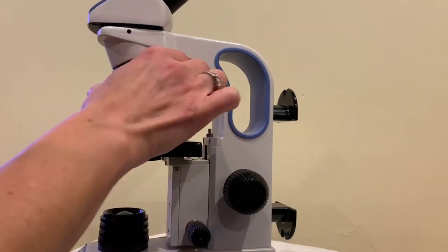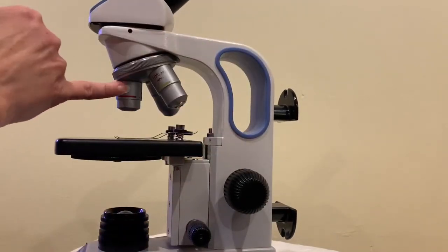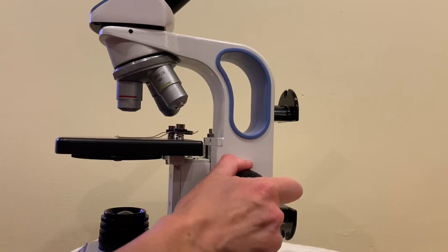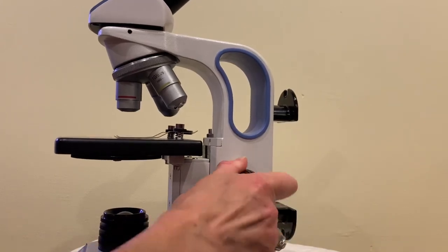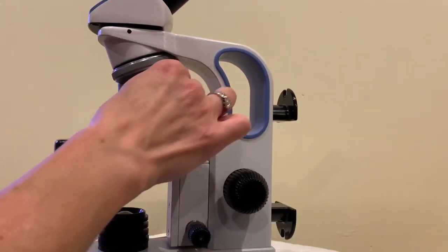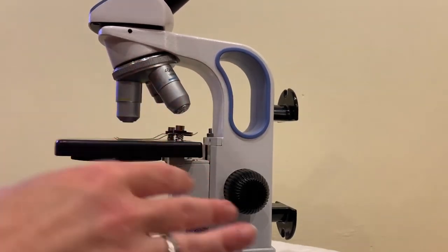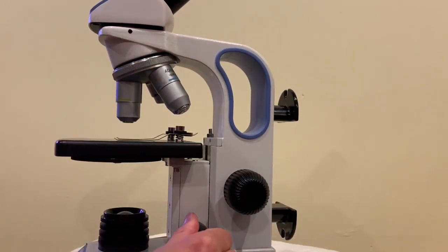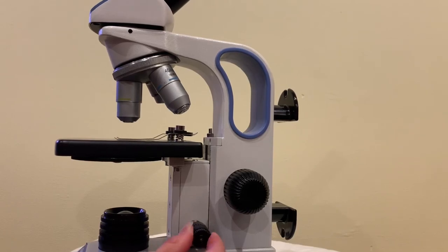So once you have everything into focus under the smallest magnification with the coarse focus knob, when you zoom in it should pretty much still be in focus but you might have to make a couple adjustments. You just move it a little bit.